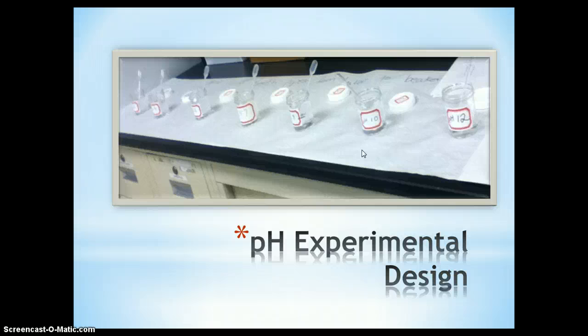After that, we added 1 milliliter of potato extract to each tube. And then, after 5 minutes, the catechol was added into each tube. After 10 minutes, the color changes were observed.